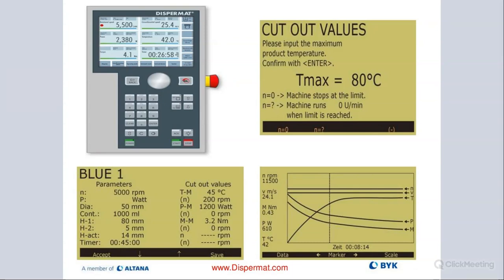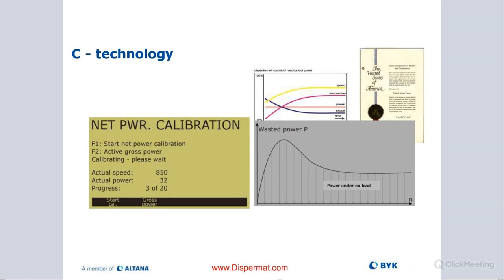And then again, we have this visualization. It looks a lot better on the new WinDisp. This is WinDisp 7; WinDisp 10 is not out yet, but on the new WinDisp, this will be very nice and graphic and give you a beautiful visualization of what's going on with the dispersion process and the different trend lines.